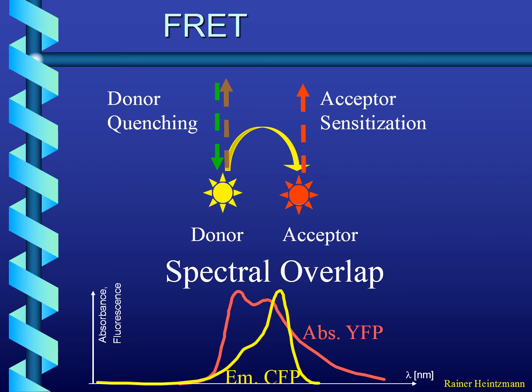You really need to go a little bit deeper into near field effects and quantum mechanics, basically the coupling of these systems, and then you can understand how you get what is called radiationless energy transfer between donor and acceptor. Nevertheless, you need the states to be able to emit and absorb. And this way, the spectral overlap integral is very important.